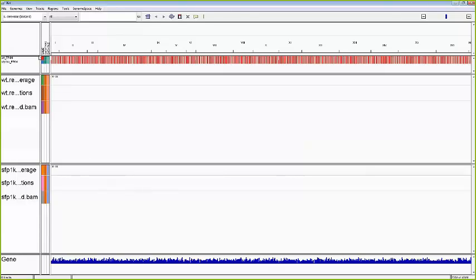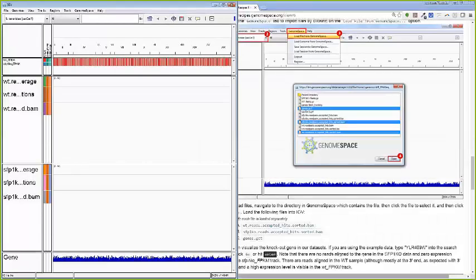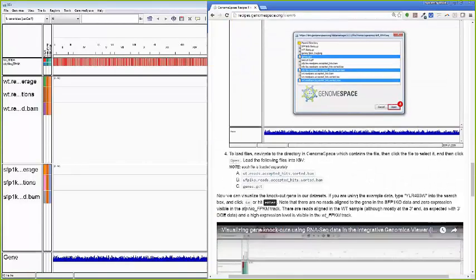So I'm going to describe what these are. These are the BAM files, and you can see that currently they're blank. The reason for this is that IGV won't be able to render everything, so we have to actually zoom in order to see something. If I continue scrolling down, I can see that at this point I need to zoom in on this specific gene that we know that we've knocked out.